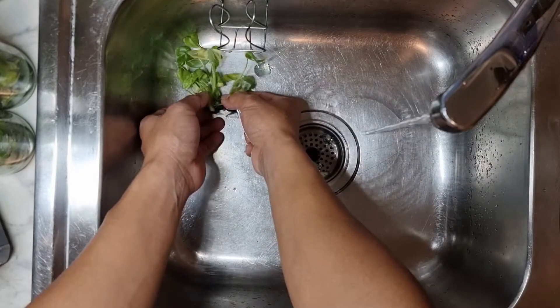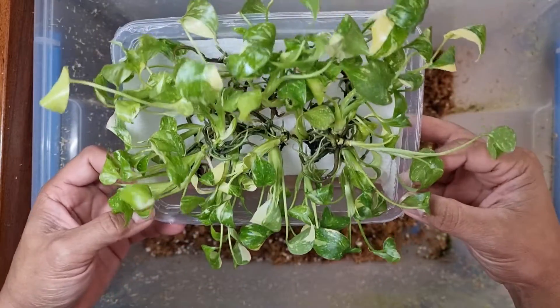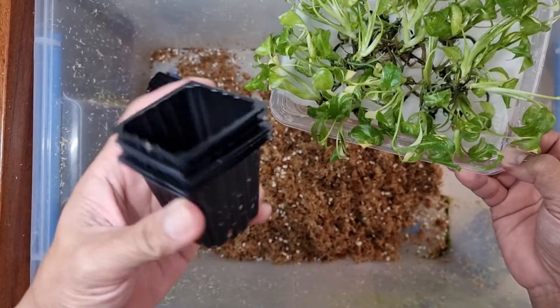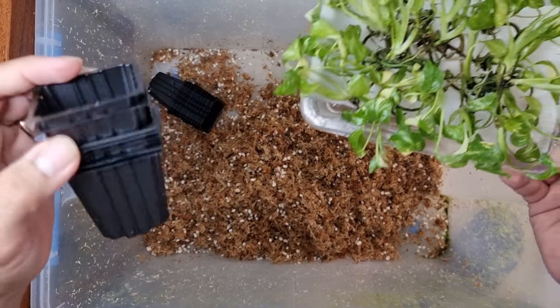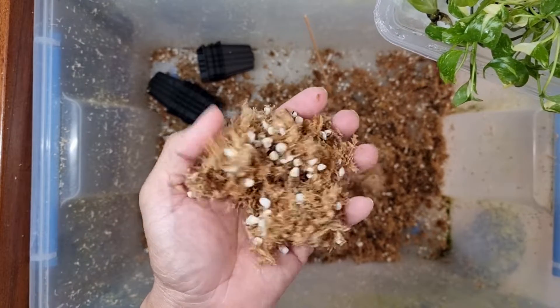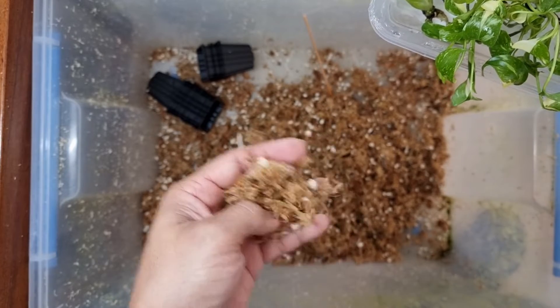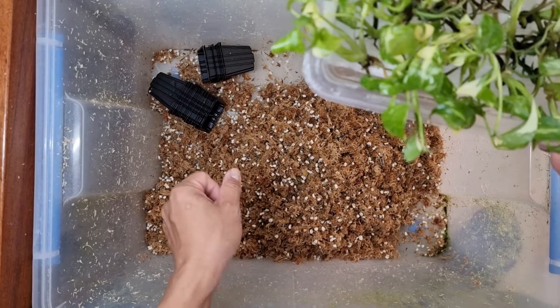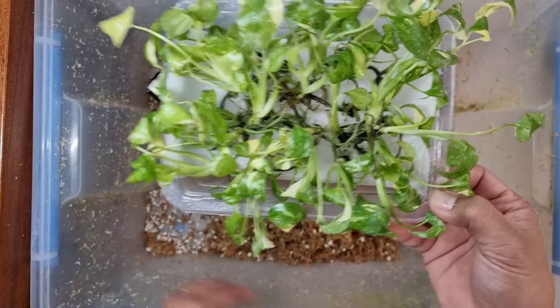We have our clean plantlets now and we're going to plant them in small pots. We use this 50 by 50 seedling tray which we cut into individual pots. We have this chopped sphagnum moss and perlite mix - the sphagnum moss has been soaked in fertilizer and nitrogen, then finely chopped. It's probably around 90% sphagnum and 10% perlite.